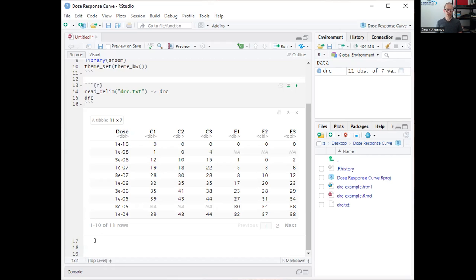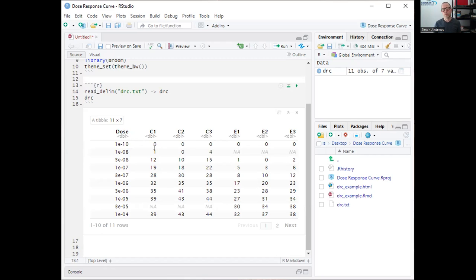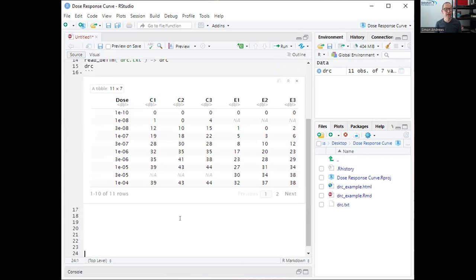The data is currently in wide format, where all our values are split into separate columns by experiment. But the general structure for tidyverse is that we want tidy, long-format data, where each column represents an experimental parameter. We want all our response values — all the numeric data — to go into a single column. So the first thing I'm going to do is restructure this into long format.